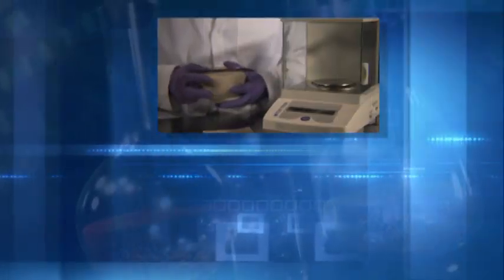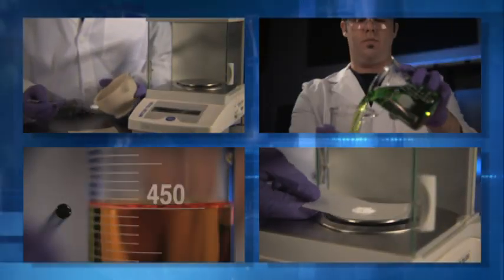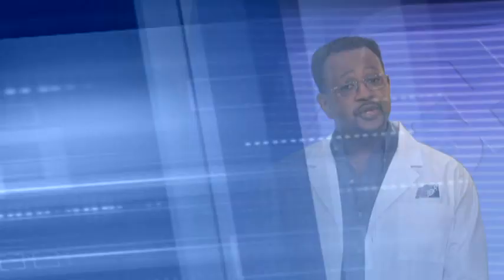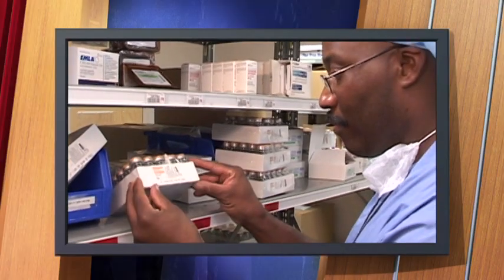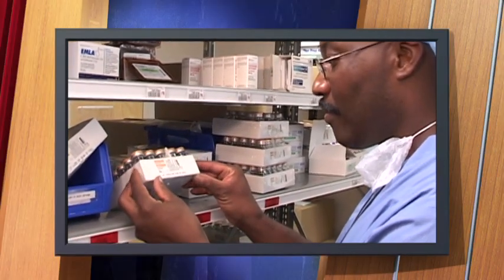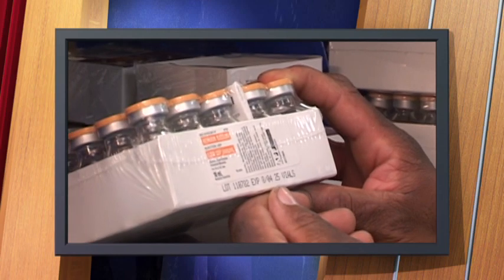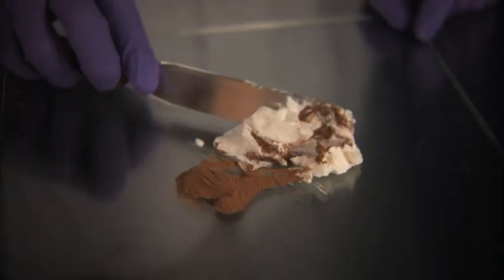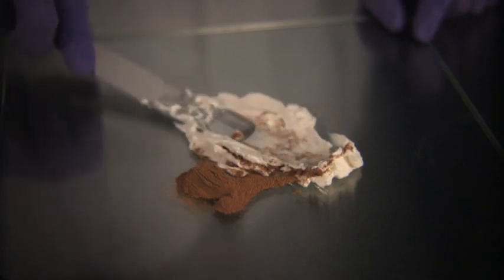Compounding is a little like baking a cake. If the ingredients in a preparation aren't measured accurately, the patient may not get the prescribed dosage, or worse yet, may get too much. Commercial medications typically come in just a few strengths and dosage forms. Compounding allows us to tailor a medication's strength and dosage form to meet an individual patient's needs.